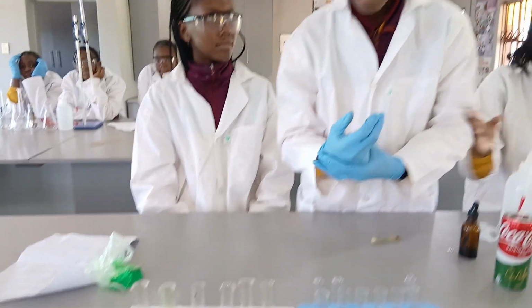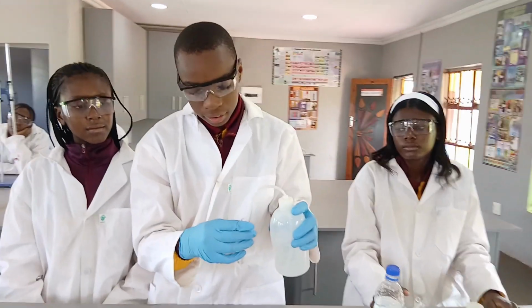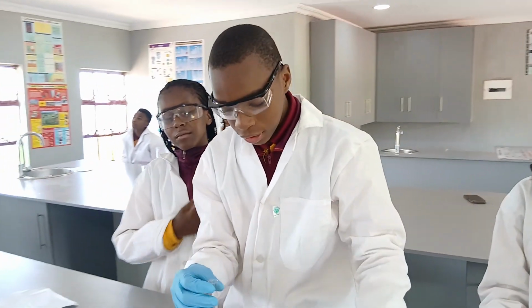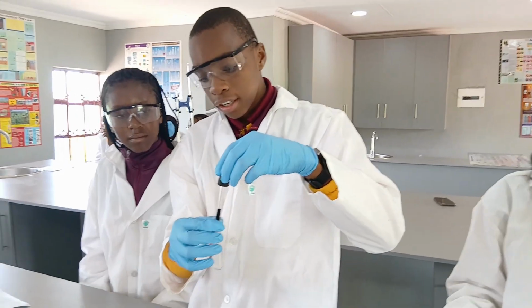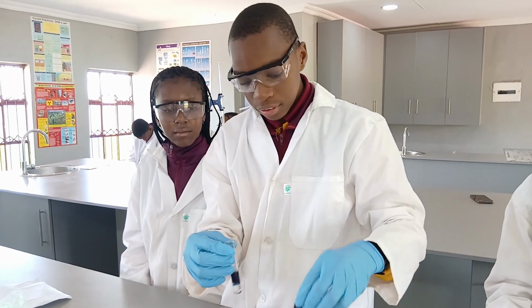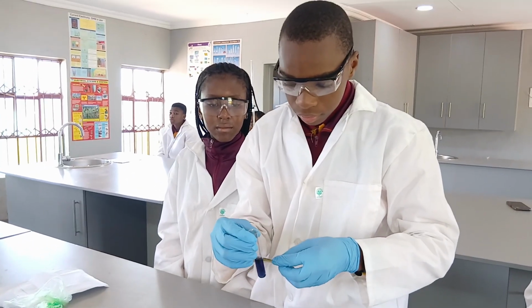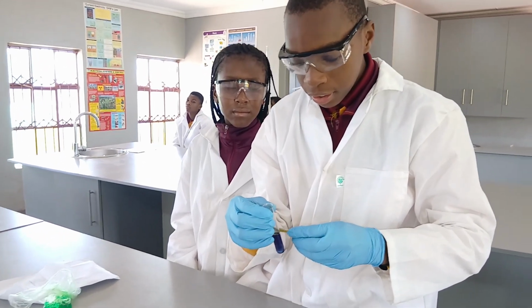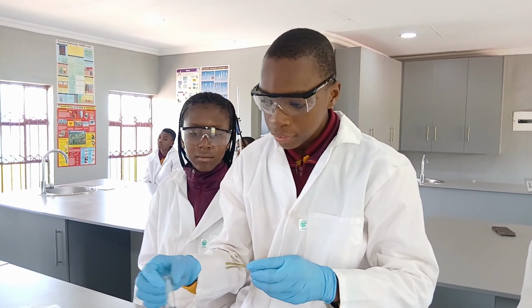Okay, so our final sample, which is water. So we pour a bit of water into this and grab our universal indicator and pour 2 drops in here. Then we shake it. So the color is more a cyan, which means that this is neutral and has a pH value of 7.